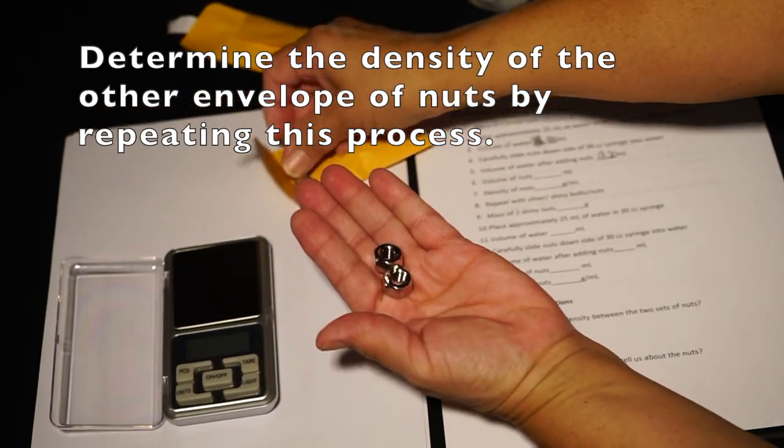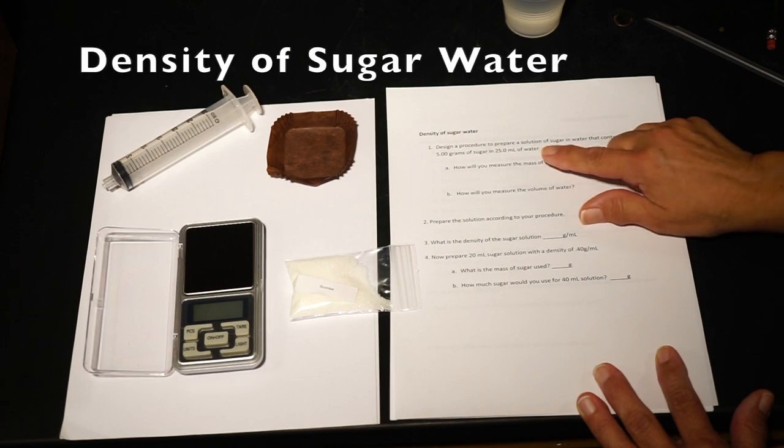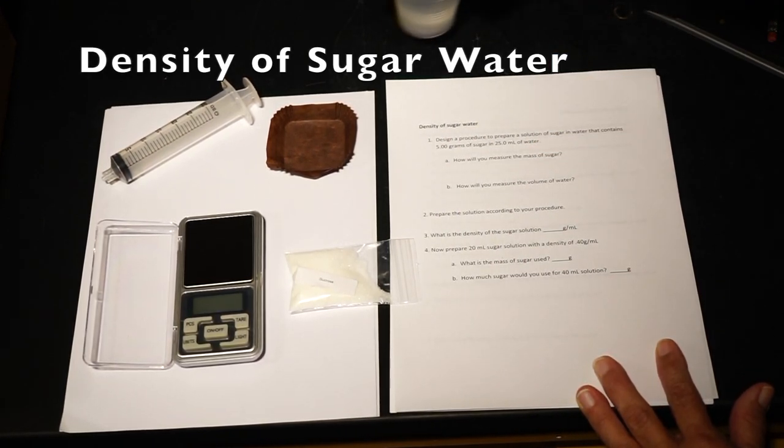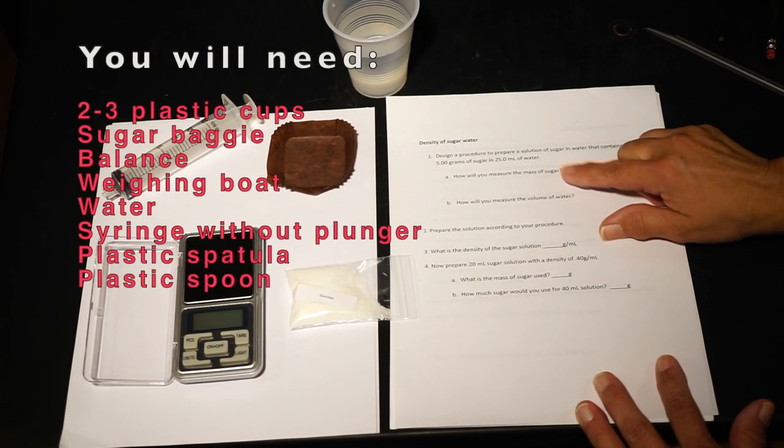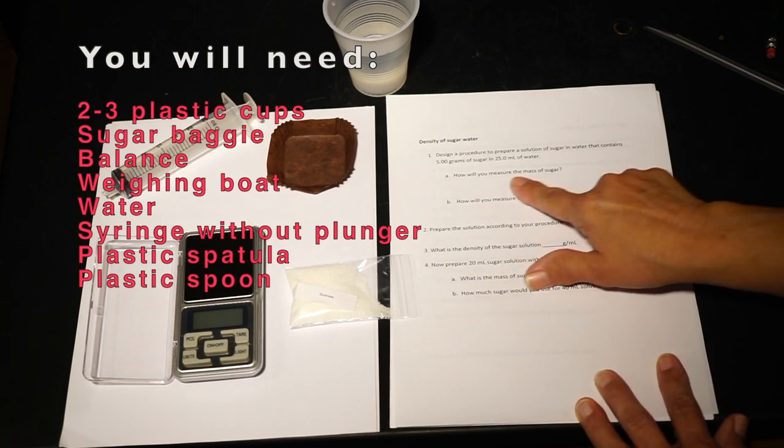Repeat this process for the other envelope of nuts. Density of sugar water: You will need two to three plastic cups, sugar baggie, balance, weighing boats, water, syringe without plunger, plastic spatula, and plastic spoon.